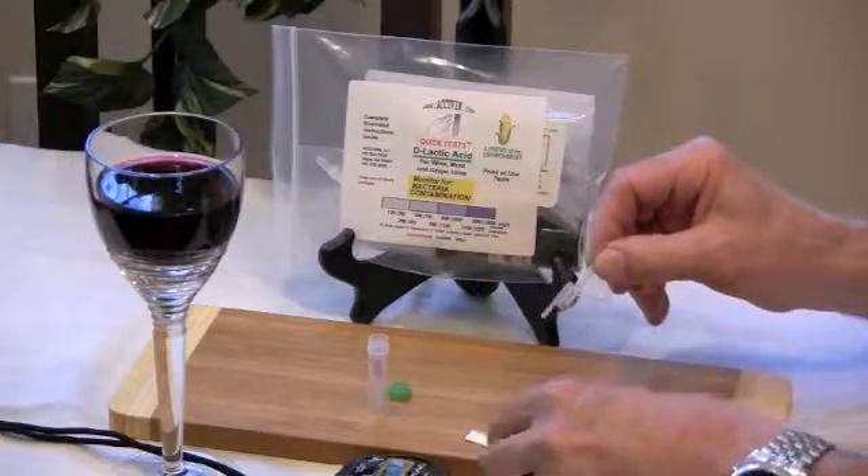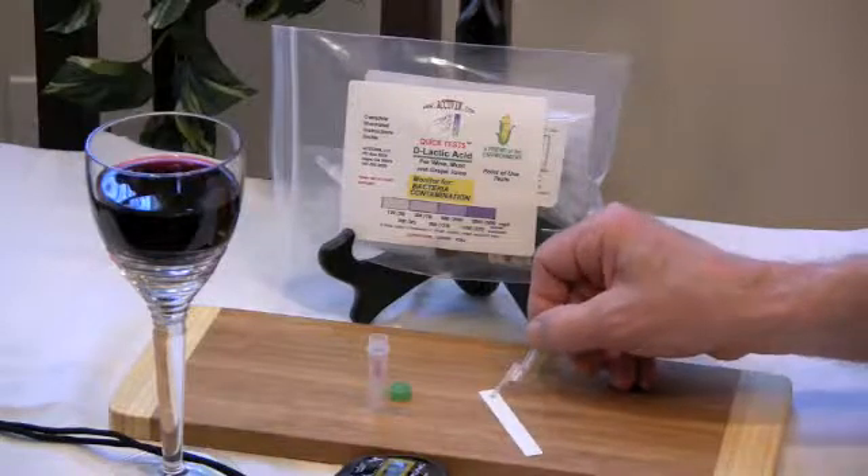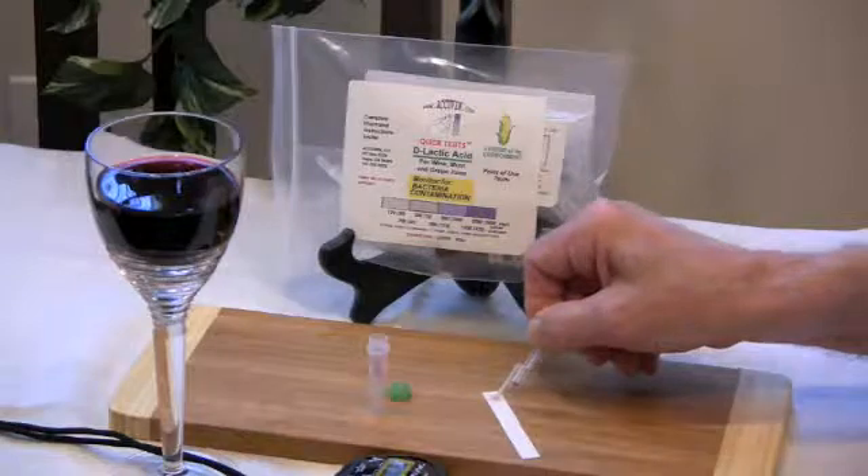Place the strip circle side down. Place the tip in the absorbent pad, apply slight pressure, and squeeze once to release the sample.